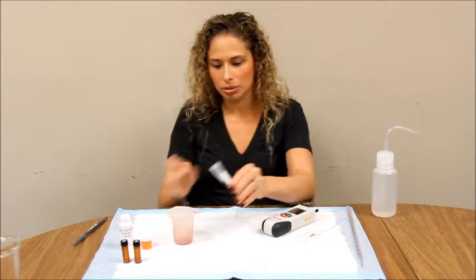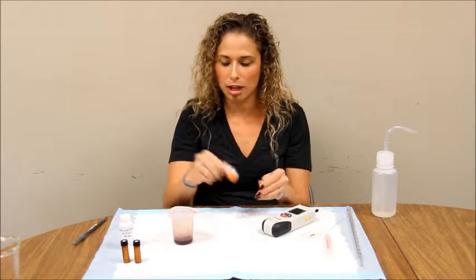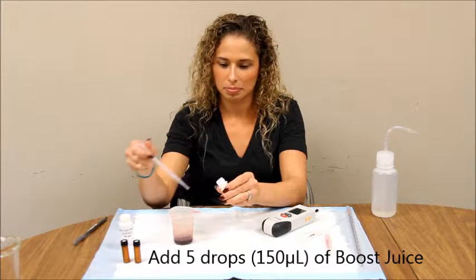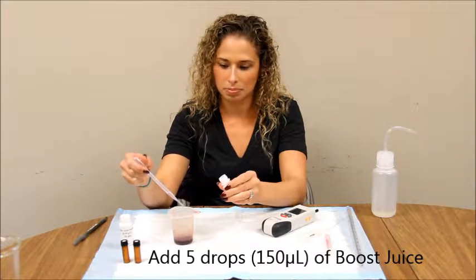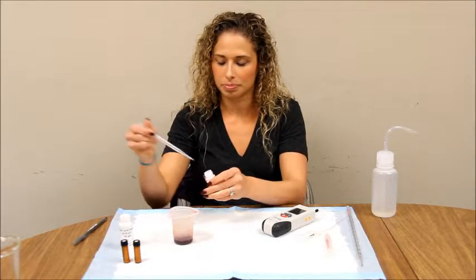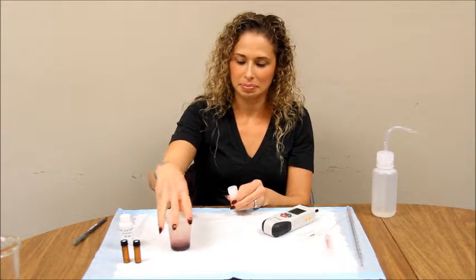Pour your sample back into your vessel and add 5 drops of your boost juice. Mix your sample. You are now ready to start your assay.